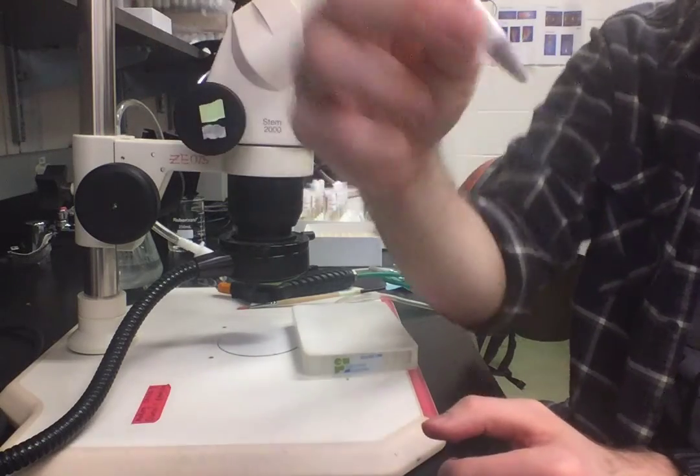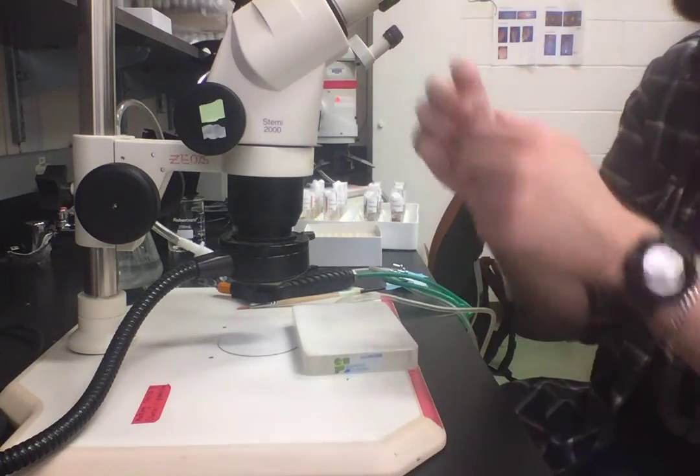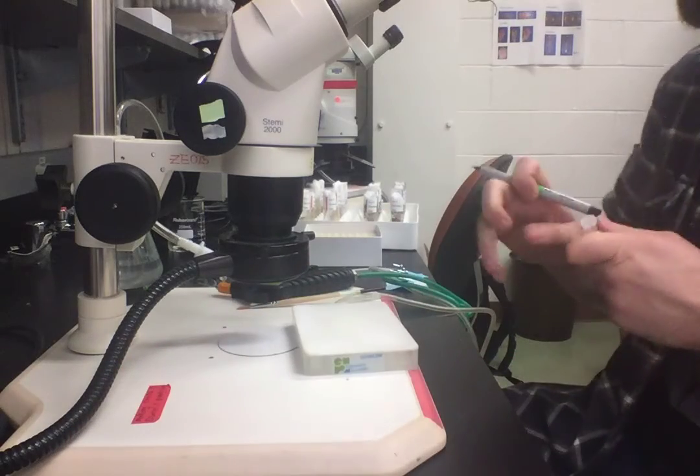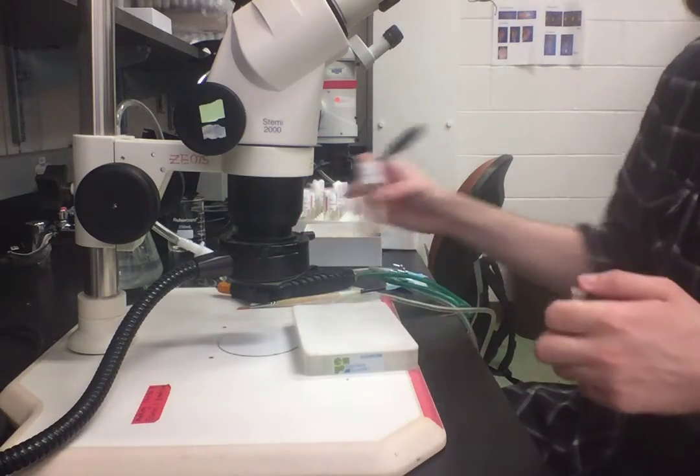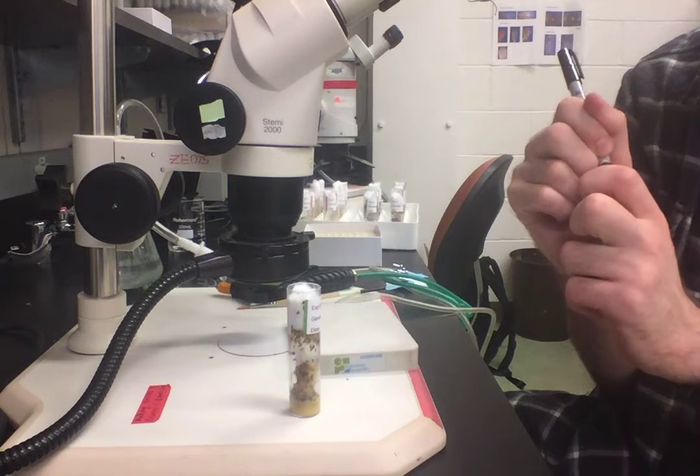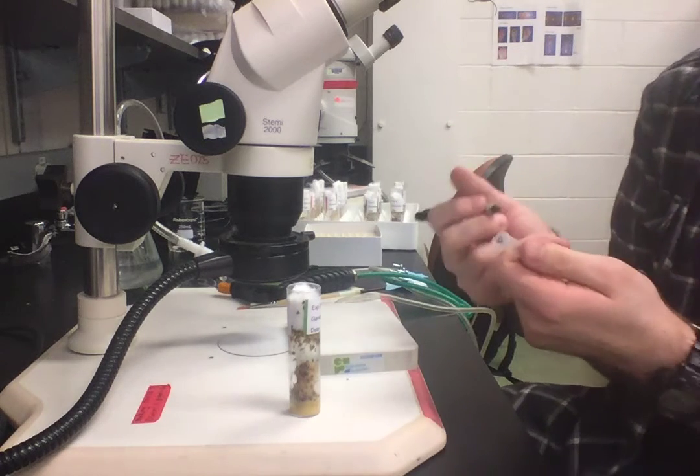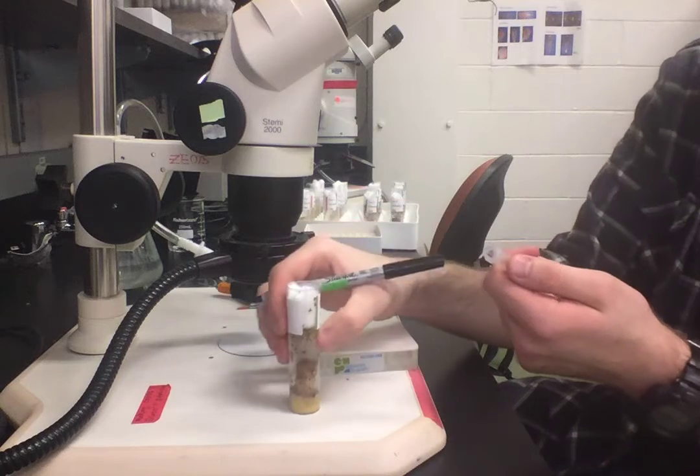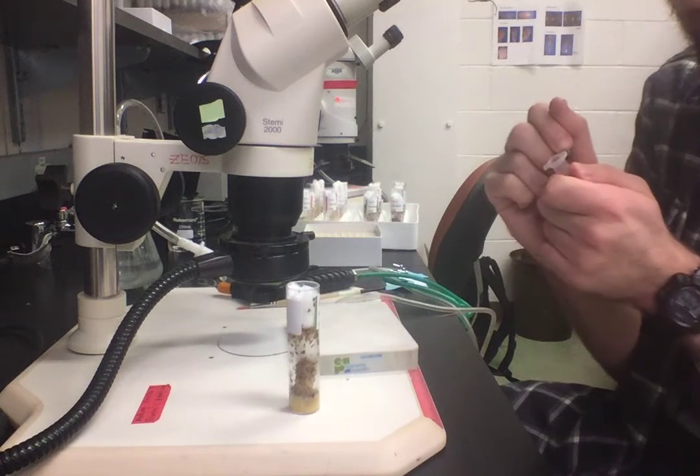You can see they're already awake and moving in here. Once you've got them in, you want to carefully label the vial, making sure that you don't miss any important information and you've put enough information on the vial that you'll be able to know exactly what these flies are.